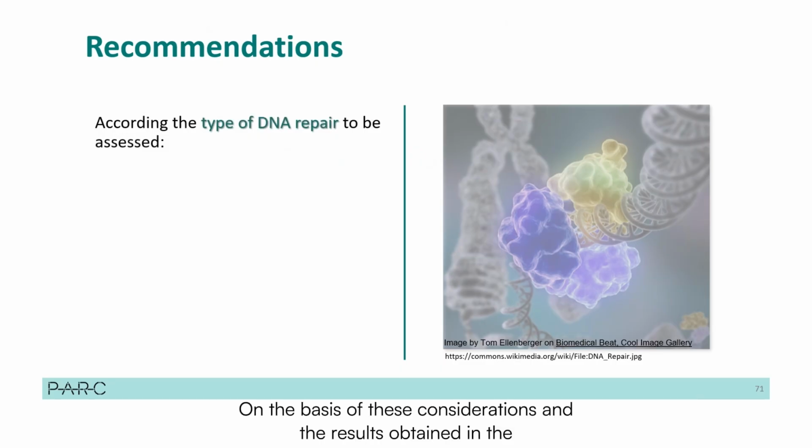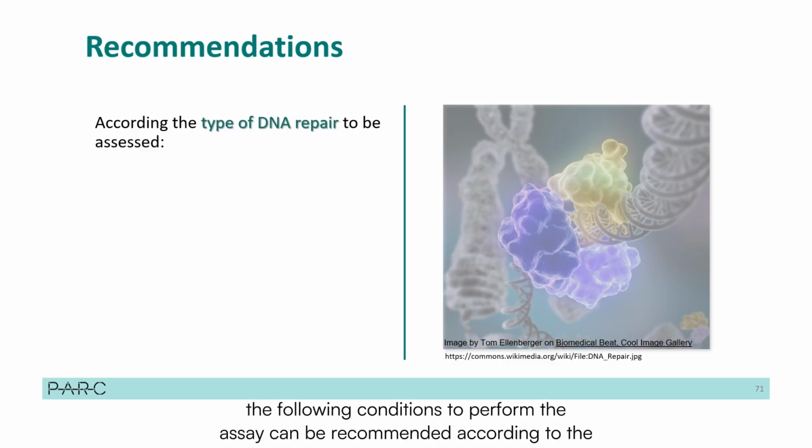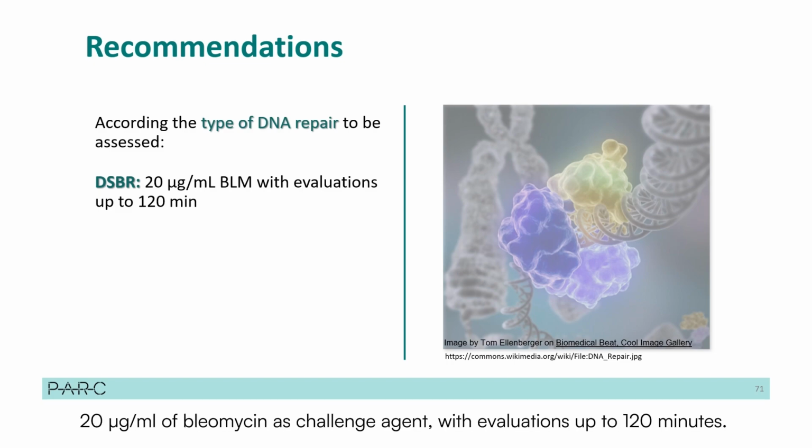On the basis of these considerations and the results obtained in the standardization of the challenge-comet assay in saliva leukocytes, the following conditions to perform the assay can be recommended according to the type of DNA repair to be assessed. For double-strand break repair, 20 microgram per ml of bleomycin as challenge agent, with evaluations up to 120 minutes.